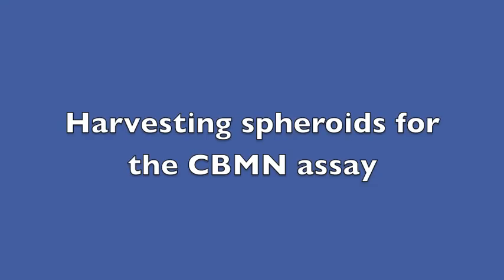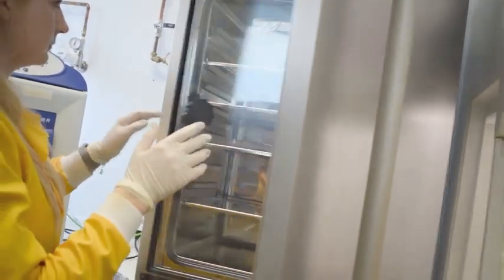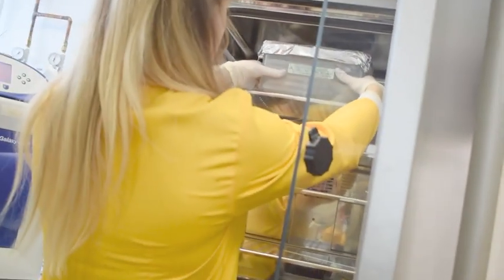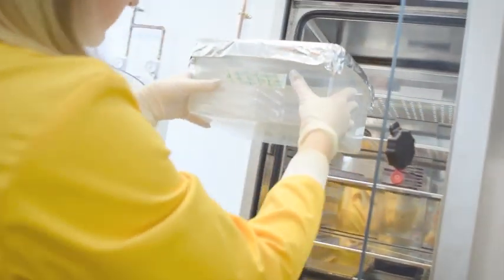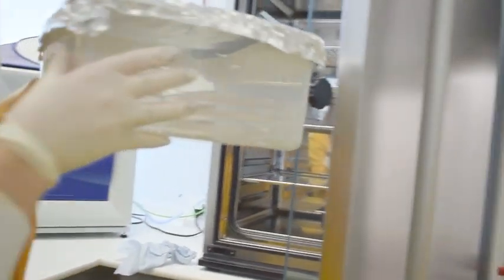Harvesting spheroids for the CBMN assay. Carefully remove the box containing multiple spheroid plates originally seeded 4 days previously.